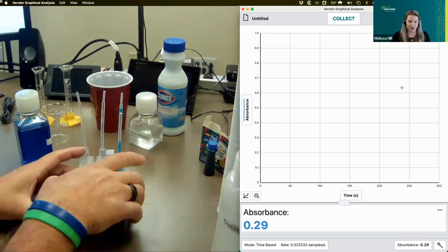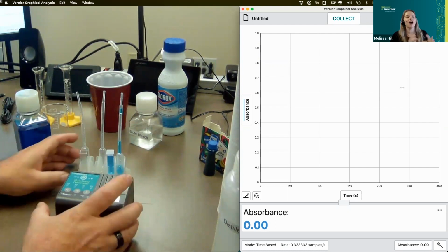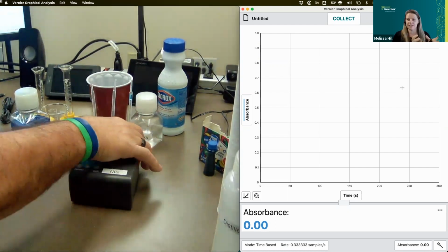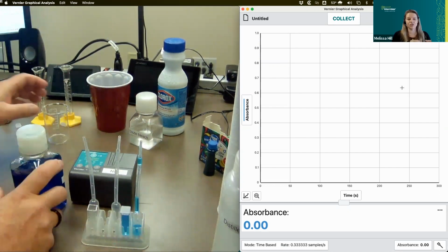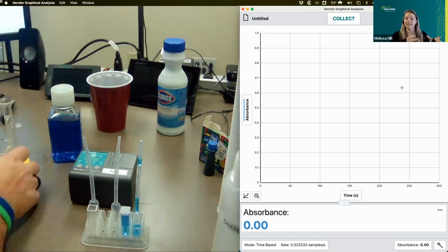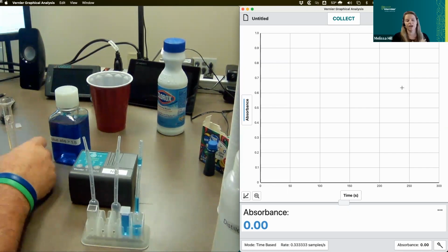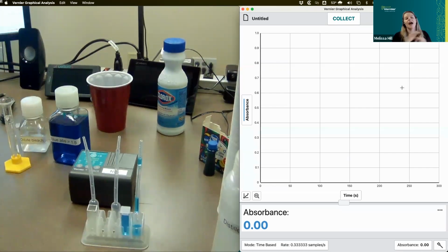If you have a spectrometer, you can do the full absorbance versus wavelength, which is the advantage of having the spectrometer. That's why we've done some webinars and some talks with the spectrometer, but a lot of people can't afford a classroom set of spectrometers. So it's really nice to either do it this way with all of your students, or you can have one spectrometer, show them the true Lambda Max, have them do it with the colorimeter, discuss the differences, discuss why it'll still work with a colorimeter, and then have your students still get that hands-on experience. We sometimes call that faux Lambda Max, we call it the shoulder.